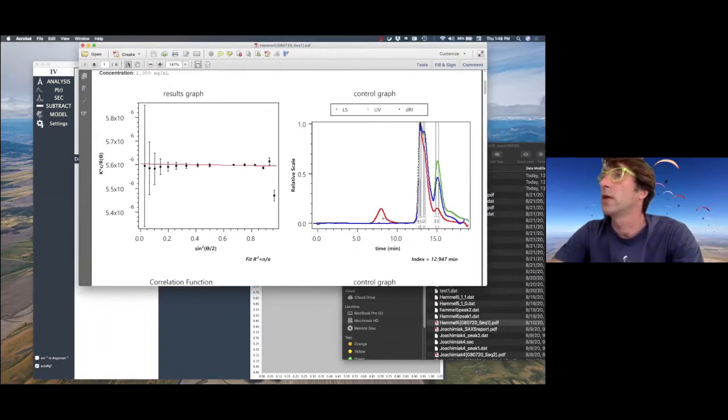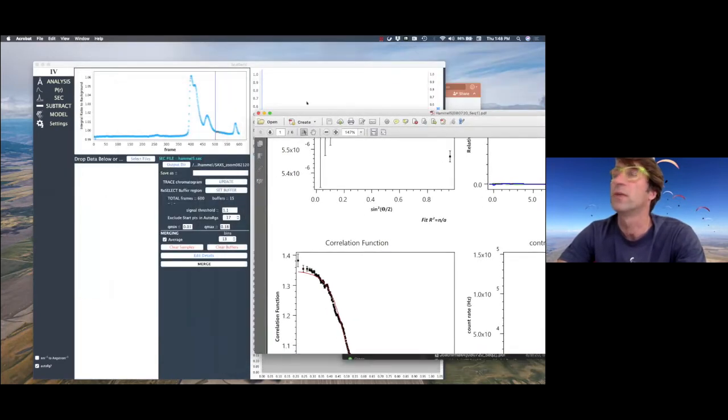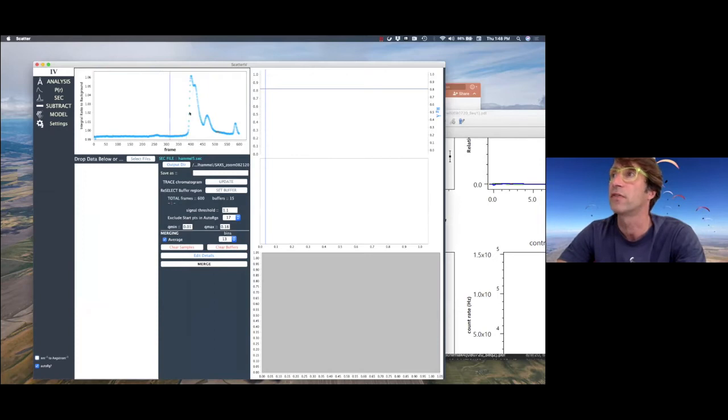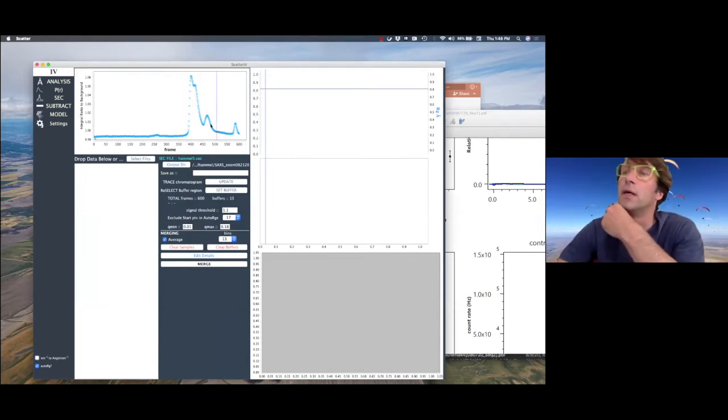Okay, so these are the aggregations. This is the first peak that is split in 2 peaks, and then we have some smaller peak in the back. This looks very similar to what we see in a size exclusion SAXS signal. This is a SAXS signal. So that's what we have. We confirm that we have a split peak and some smaller peak.